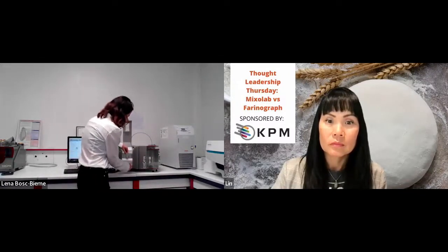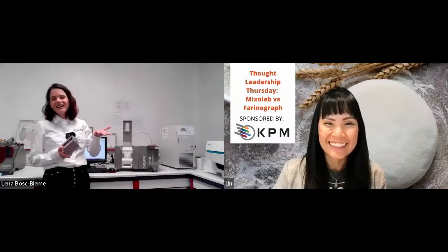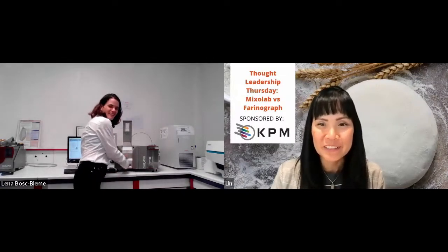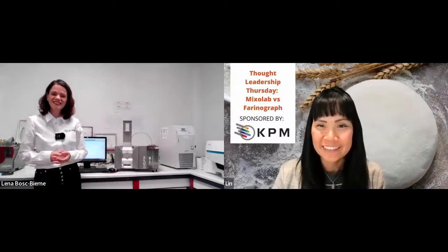Then the mixing bowl can be completely removed from the Mixolab. Oh, that's easy for cleaning. Exactly, and all the pieces can be separated. So yes, very easy cleaning. Awesome. This is why we requested for us to live stream into your lab today, so that we could see all these little different things.